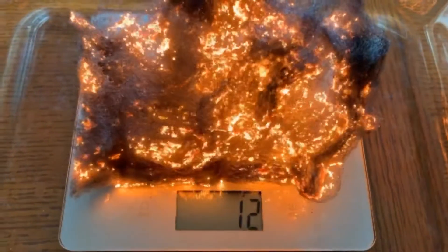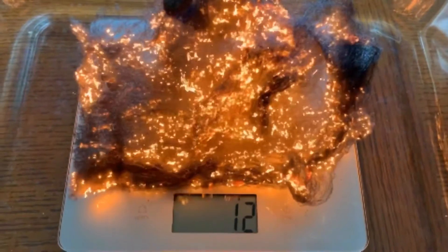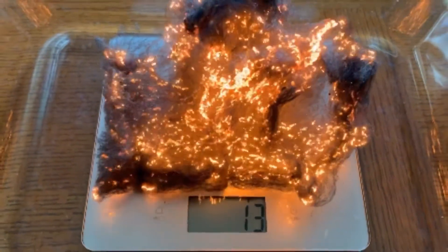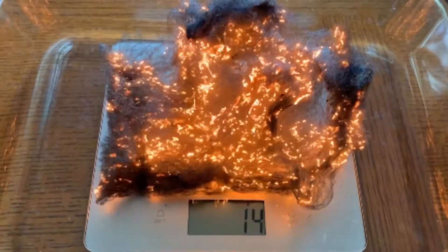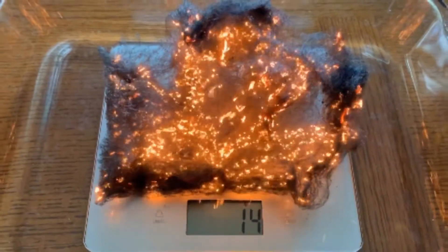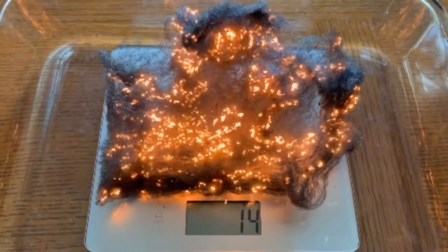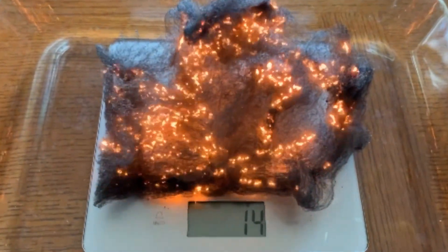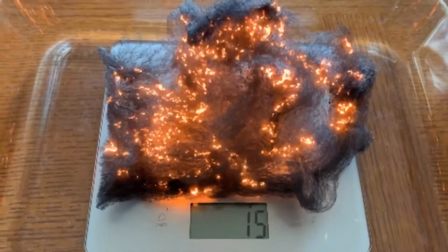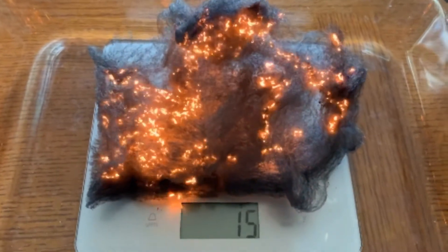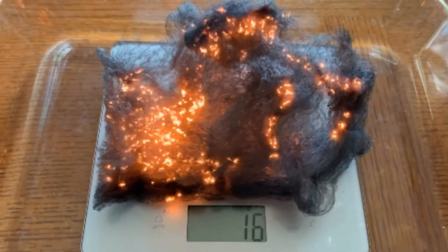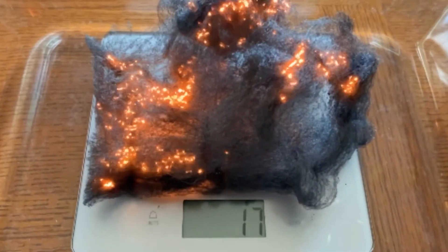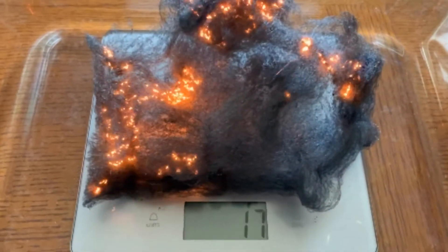It changes during combustion. Why does it gain mass while it's burning? Now it's up to 13, 14, up to 15, 16 now — gaining mass during combustion. Why is it getting heavier while it's on fire?